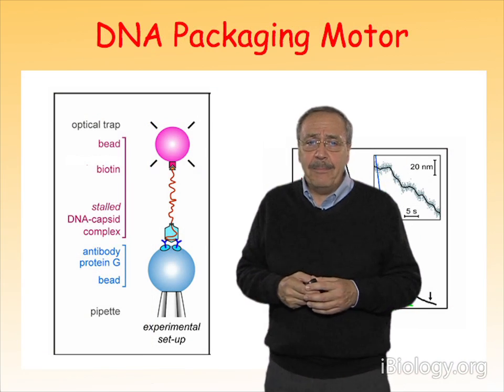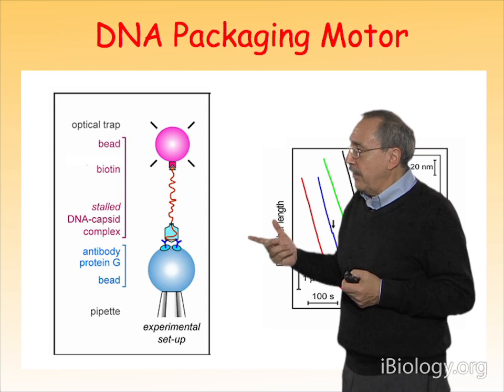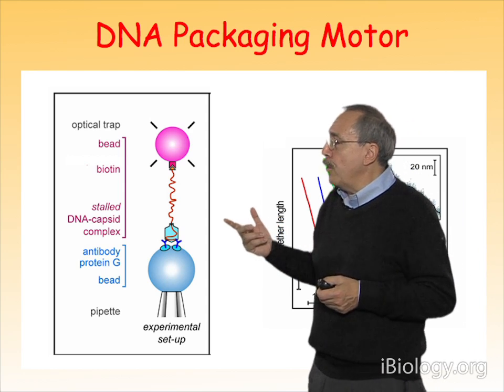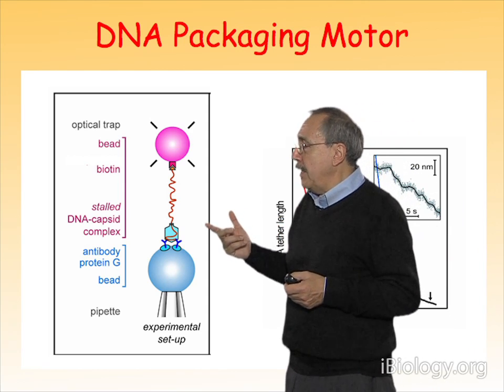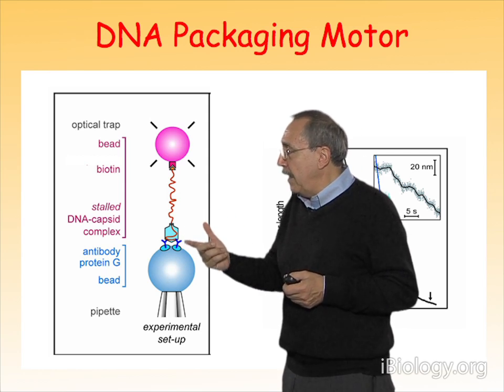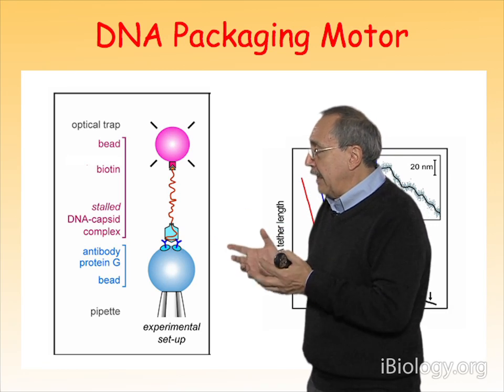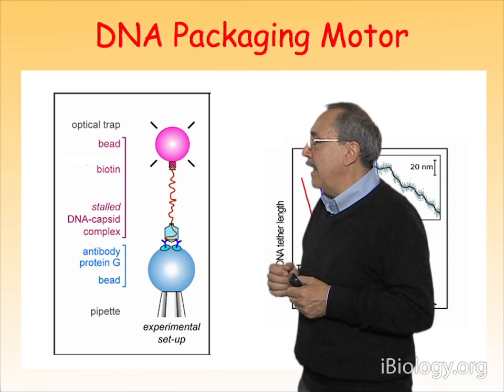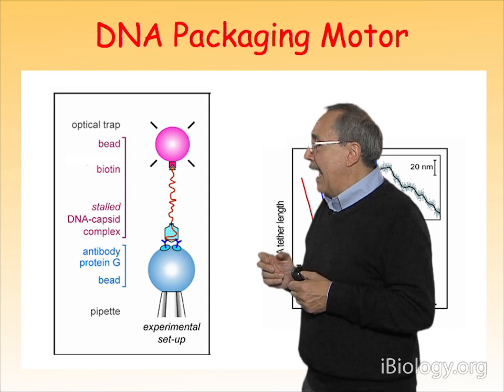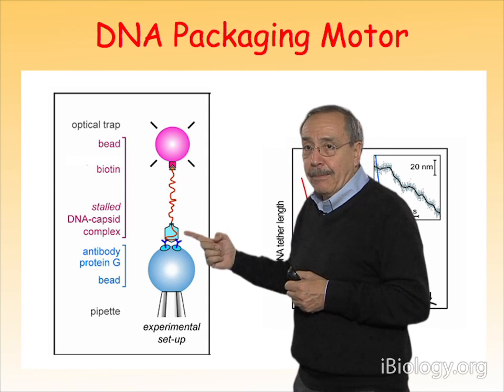Let me give you an example of experiments done in that fashion. This is a system that we study in our laboratory. It's a bacteriophage Phi29, which is a virus that infects Bacillus subtilis, and these capsids of the bacteriophage self-assemble inside the host cell, and at the end the DNA has to be actually put inside the capsids, okay?